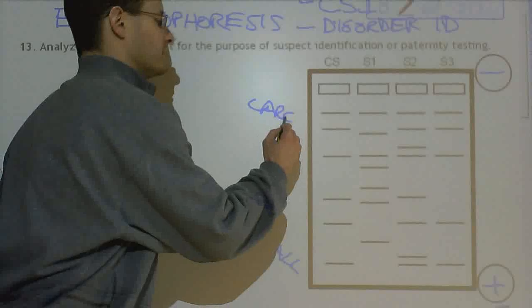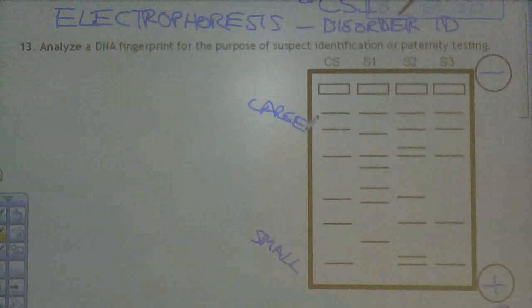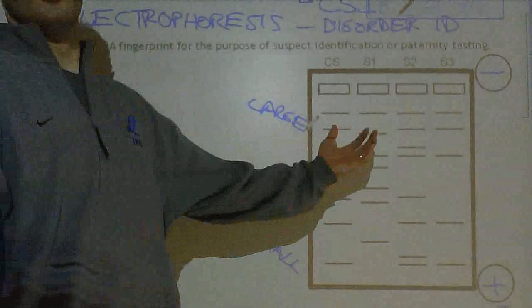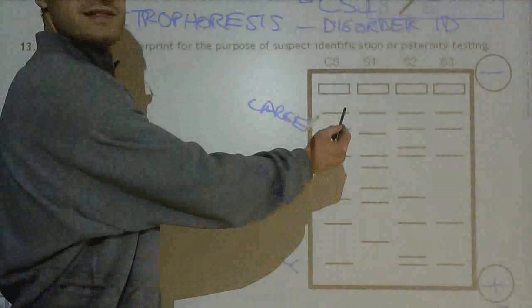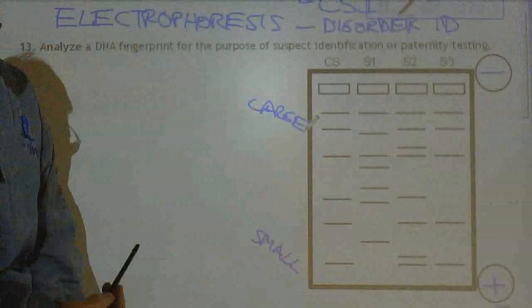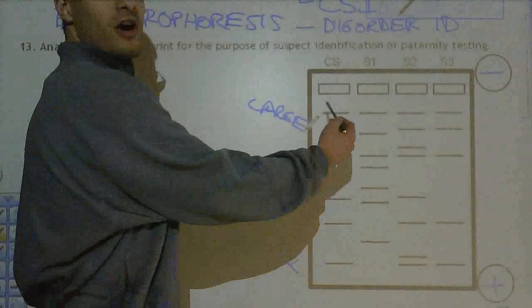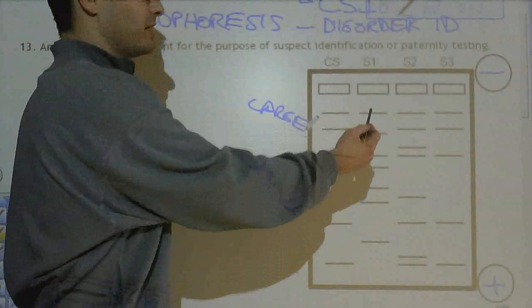The largest ones are up here at the top in our example. So to analyze this DNA fingerprint, we would have these bands already separated out. And something to keep in mind here, these bands don't represent one segment of DNA. These bands are thousands, probably tens or hundreds of thousands of segments of DNA that are all collected at this location, distance from each well.